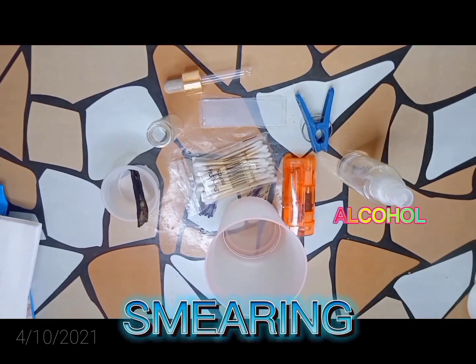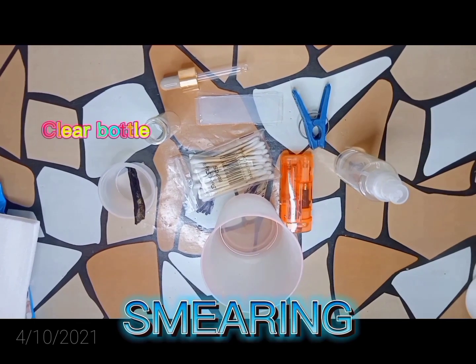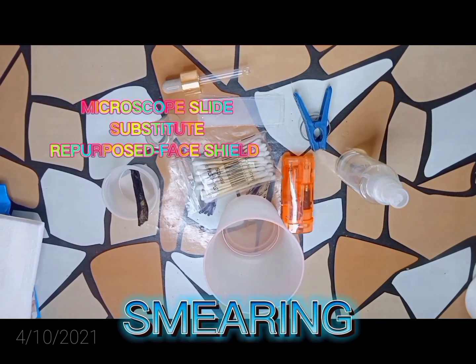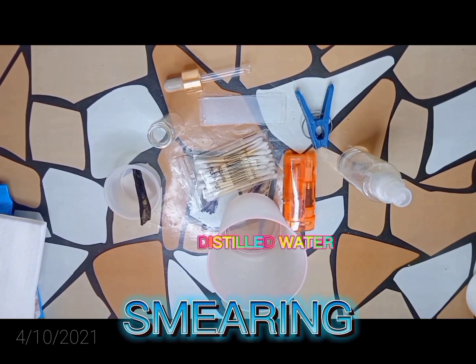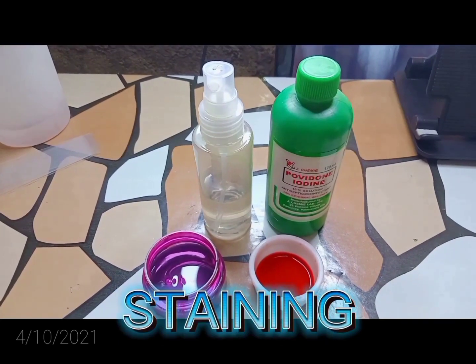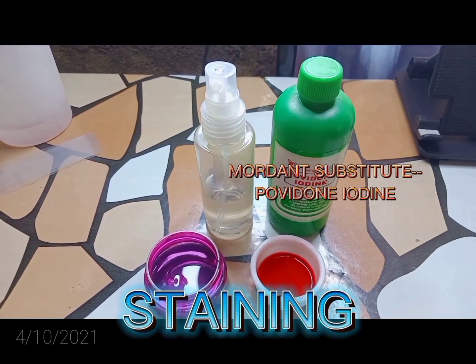Now I am going to show you the materials that we are going to need in our laboratory setting for today. For smearing: bulb, alcohol, dropper, lighter, clear bottle, microscope slides, clothesline pin, cultured bacteria sample, distilled water. For staining: purple dye, ethyl alcohol, red dye, povidone iodine, and tissue paper. And I am going now to perform in front of you the smearing procedures step by step.